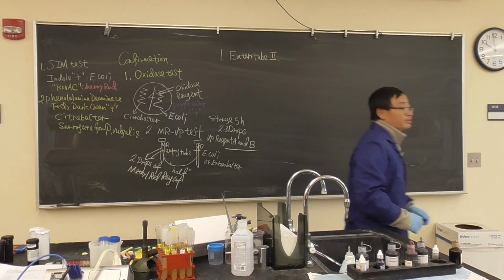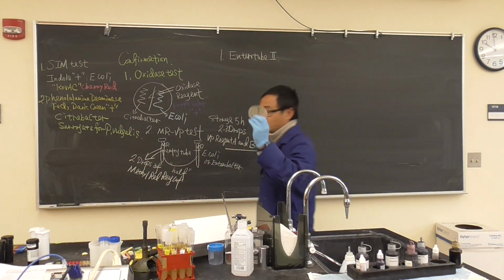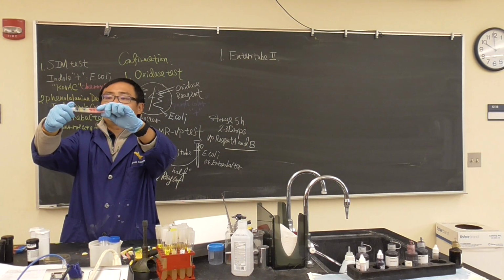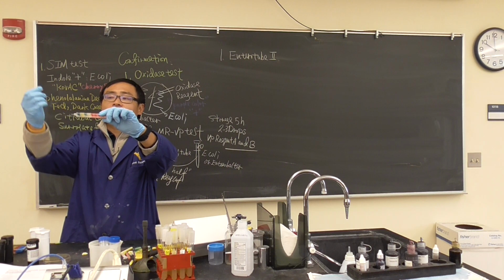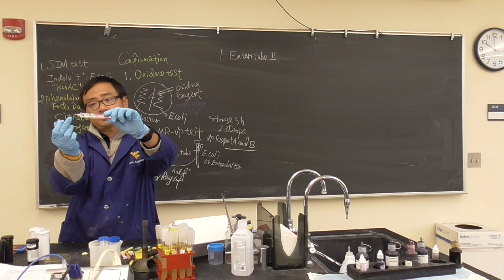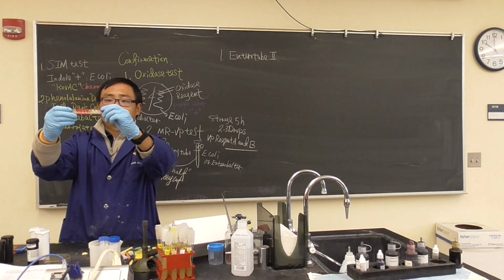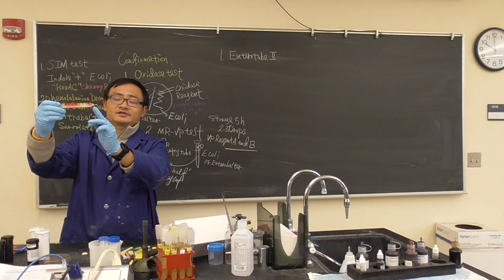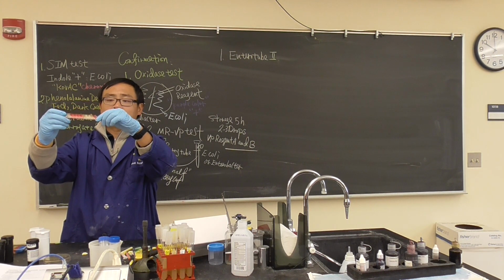So let's borrow one plate from here. This has Citrobacter and E. coli. I will do E. coli. How to do it? We are going to take off this cap. Let's look at this. Okay, a black one, a white one, it's a needle. I'm just doing an observation for you. The blue one is a kind of clicked holder. It's like a holder.